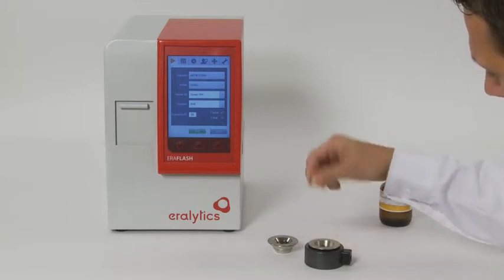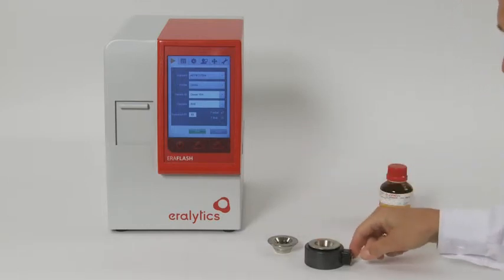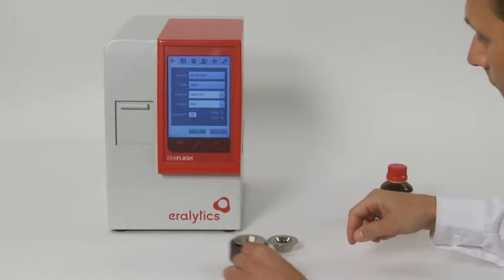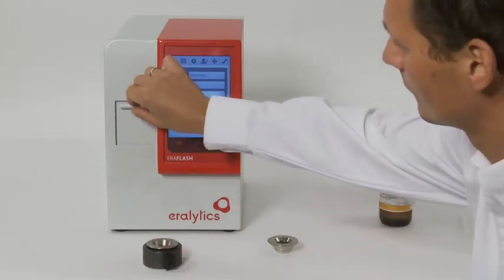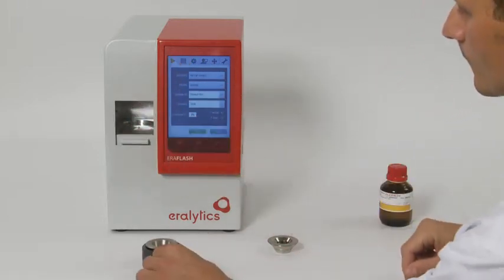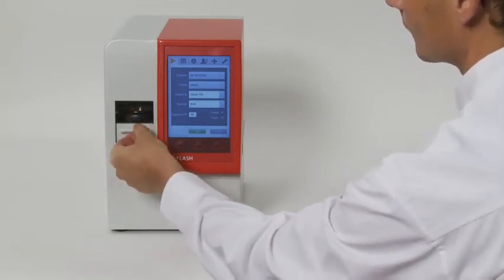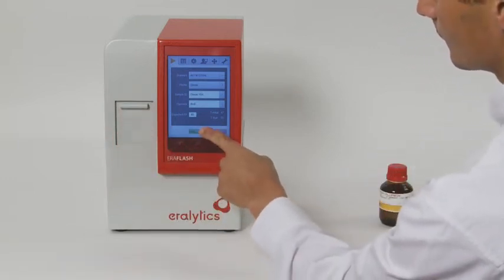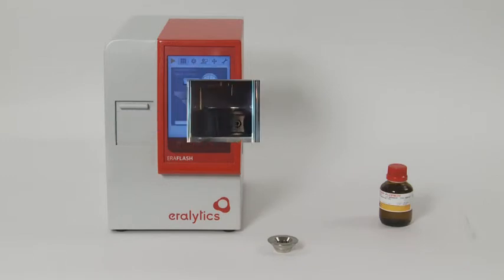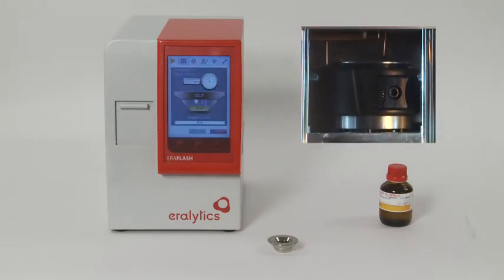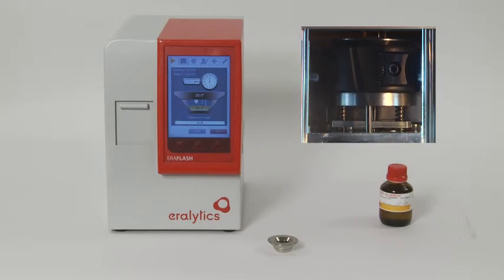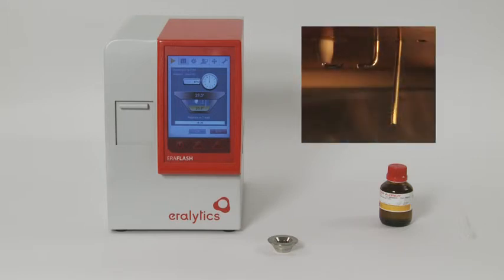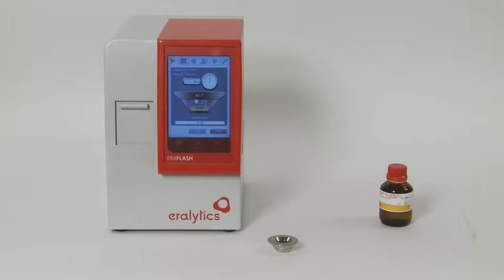Open the front door to place the sample cup inside the instrument. Close the door and press Run. The test measurement starts by lifting the sample cup to create a continuously closed chamber. Its unique design makes the Eralytics Flash the safest flashpoint tester available because there are no open flames or glowing wires at all during the measurement.